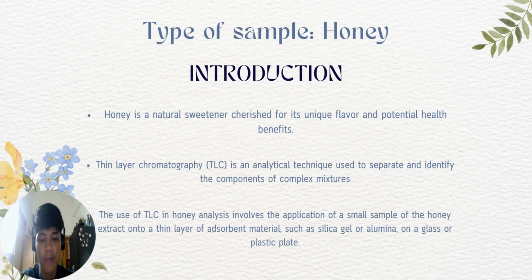In the context of honey extraction, thin-layer chromatography plays a crucial role in identifying and quantifying various compounds present in honey, such as sugar, organic acid, phenolic compounds, and other bioactive substances. By using this method, scientists and researchers can gain insight into the composition and quality of different types of honey, as well as detect any potential adulteration and contamination.